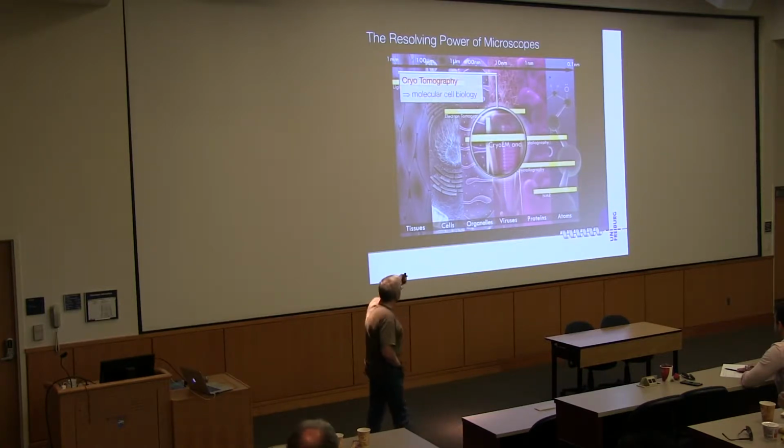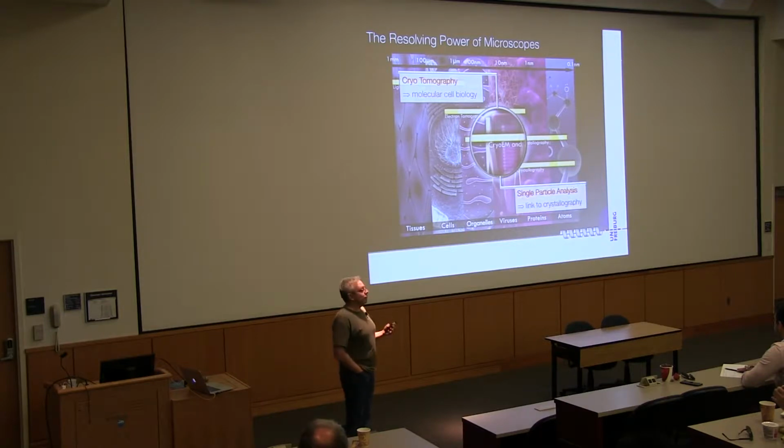So that would be a link to cell biology, while on the other side, we have what's called single particle analysis, and that is what gives you atomic resolution information.